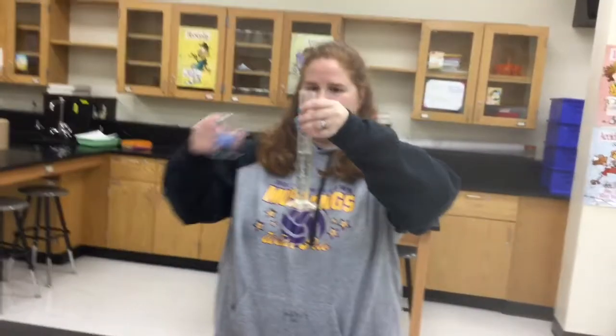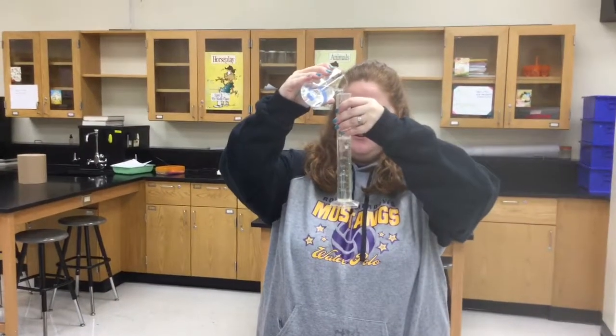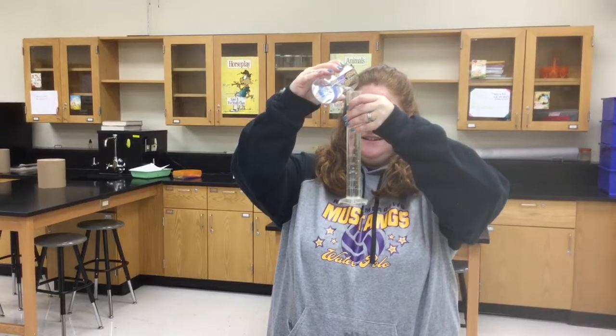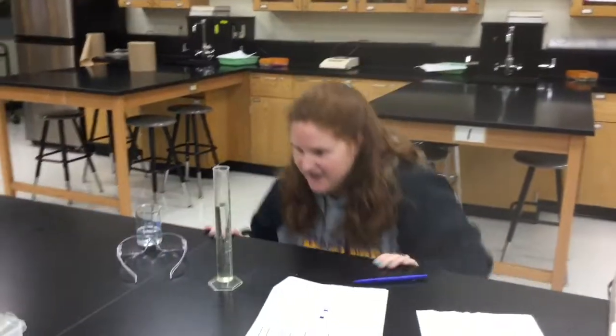All right, and then one final more water trial. Woo! All right. Go big. Go big or go home. I'm going up to 90. Oh, shoot. Okay. Do it. All right, I think. All right, Miss Thorburn, what's it say on the meniscus?